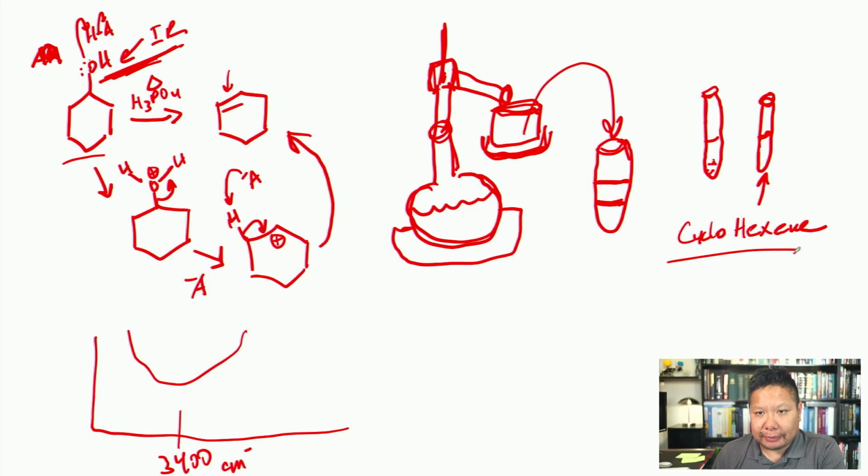So that's basically the lab that you're doing today. It's pretty simple. Of course, request the data from the report submissions tile, and also look at the PDFs that are provided, because one of the PDFs is the instructions for the lab, and the other PDF is the spectra of both your starting material, the cyclohexanol, and the IR spectra for the product, the cyclohexene. Makes sense? Good stuff.